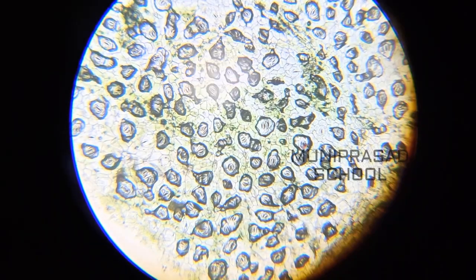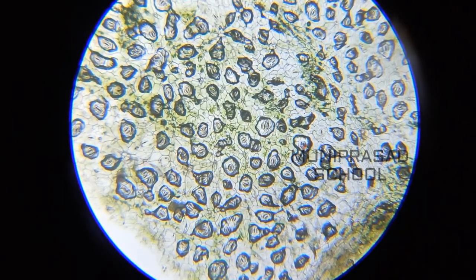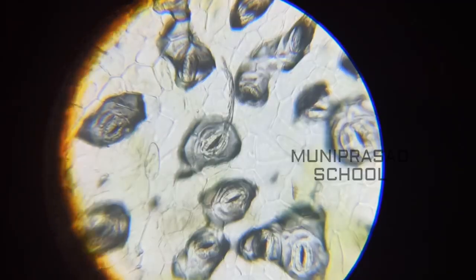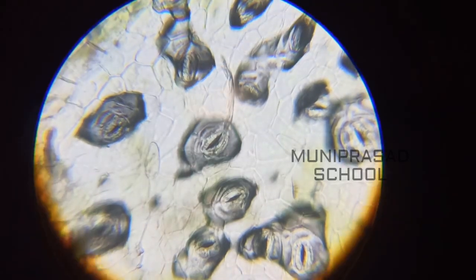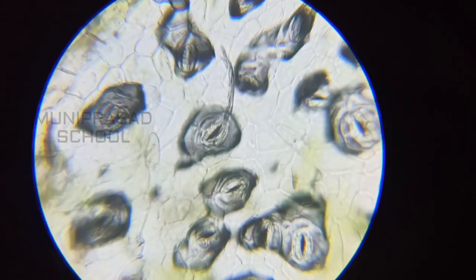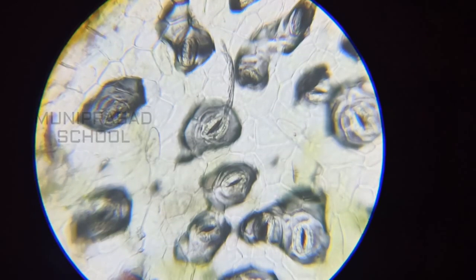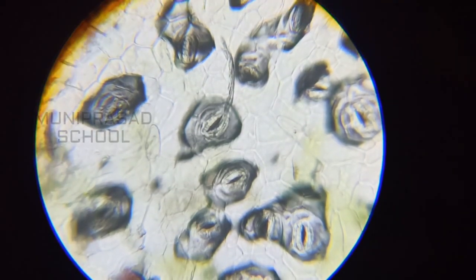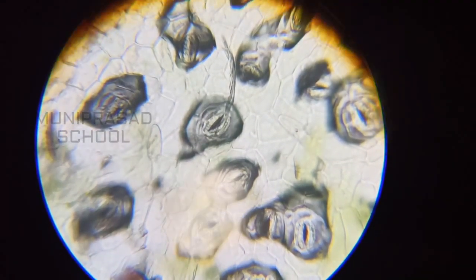Let us zoom and see. Yes, these stomata are enclosed by two kidney-shaped cells. They are called guard cells.